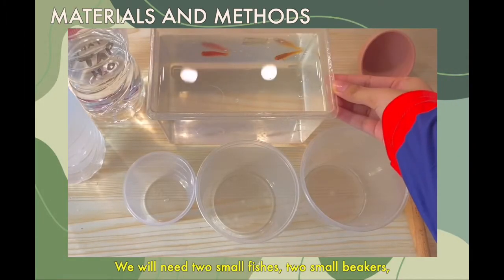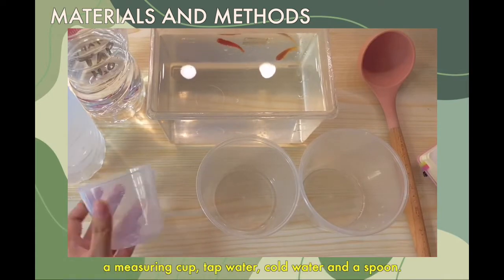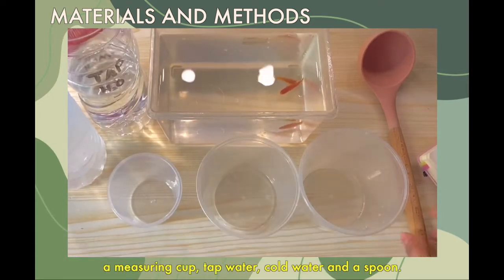These are the materials we need. We need 2 small fishes, 2 small beakers, a measuring cup, tap water, cold water, and a spoon.